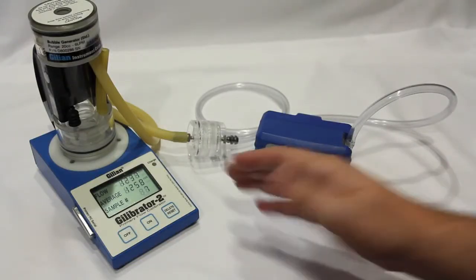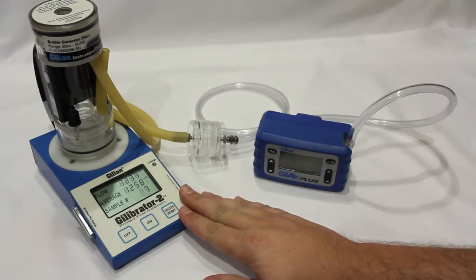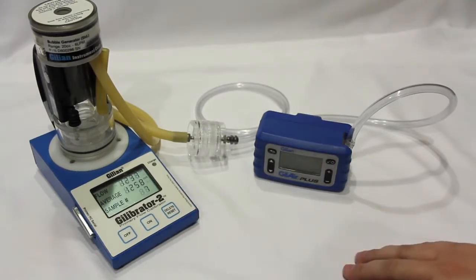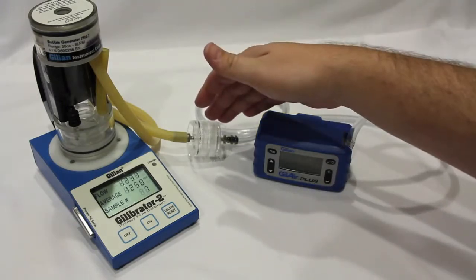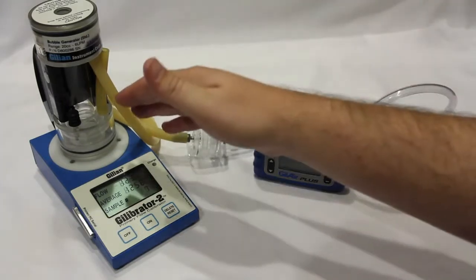To begin calibrating, set up the air flow calibrator per the manufacturer's instructions. Ensure that your sampling media is in line between the air sampling pump and the calibrator.